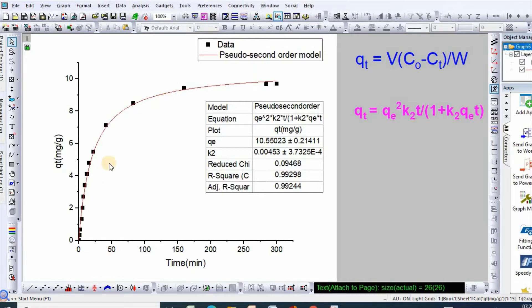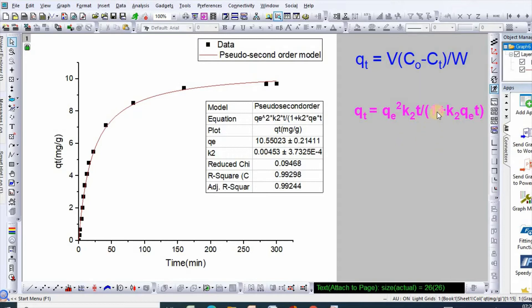After calculation, a time versus qt plot is drawn. Then the pseudo-second-order or pseudo-first-order or Avrami model is fitted using both nonlinear and linear equations. However, nonlinear model fitting is much more appropriate than linear forms. I have fitted this graph using the pseudo-second-order nonlinear model. The pseudo-second-order equation is written as: qt = qe² · k2 · t divided by (1 + k2 · qe · t).